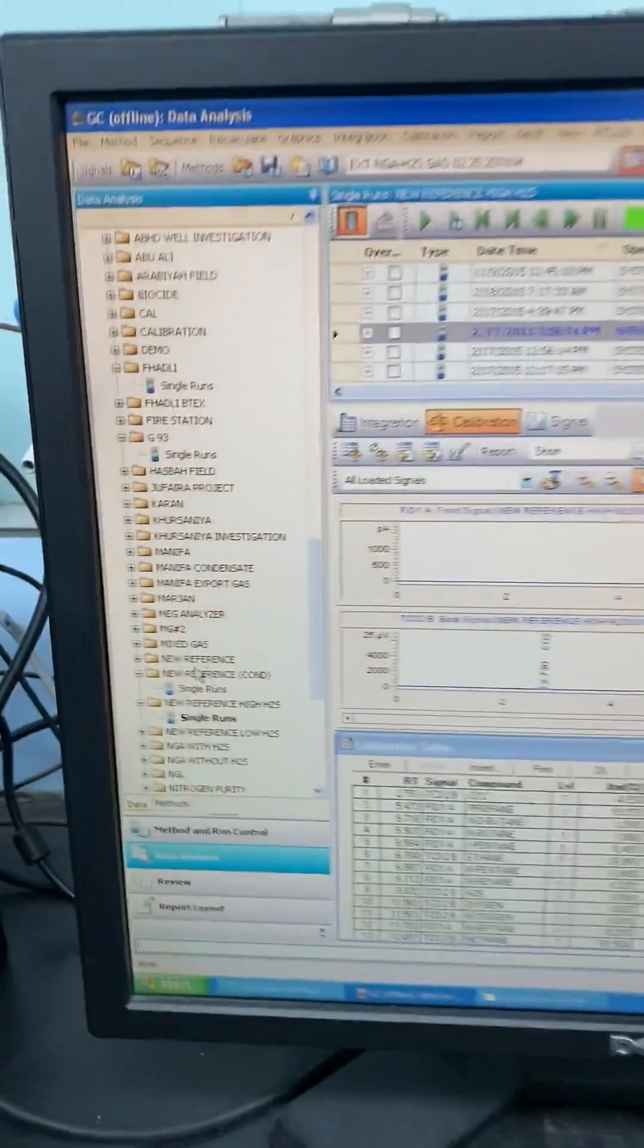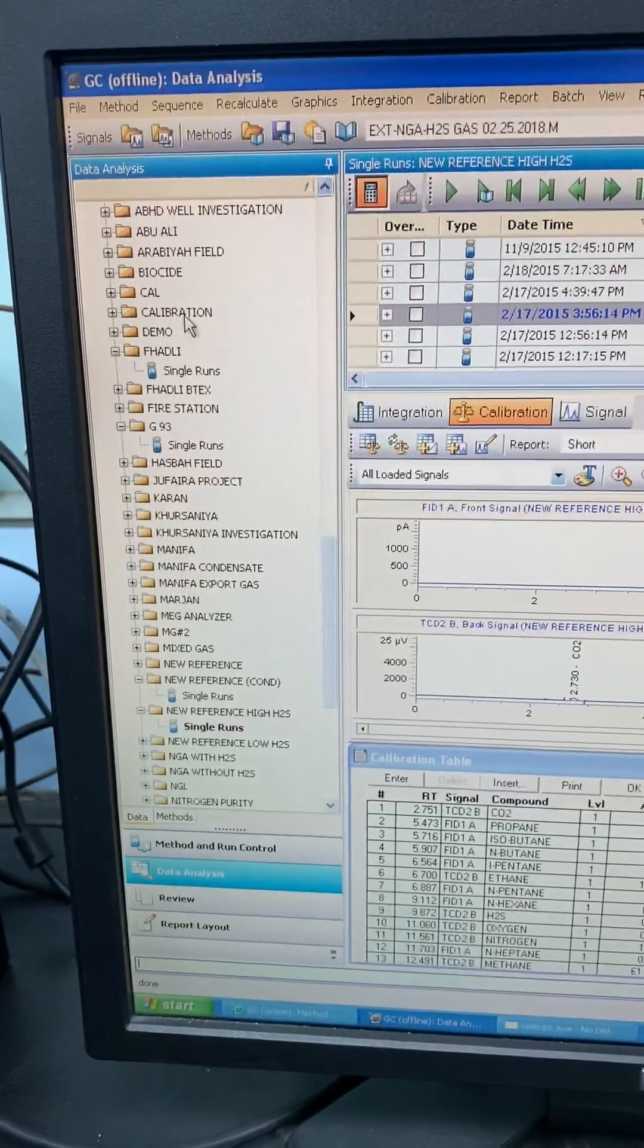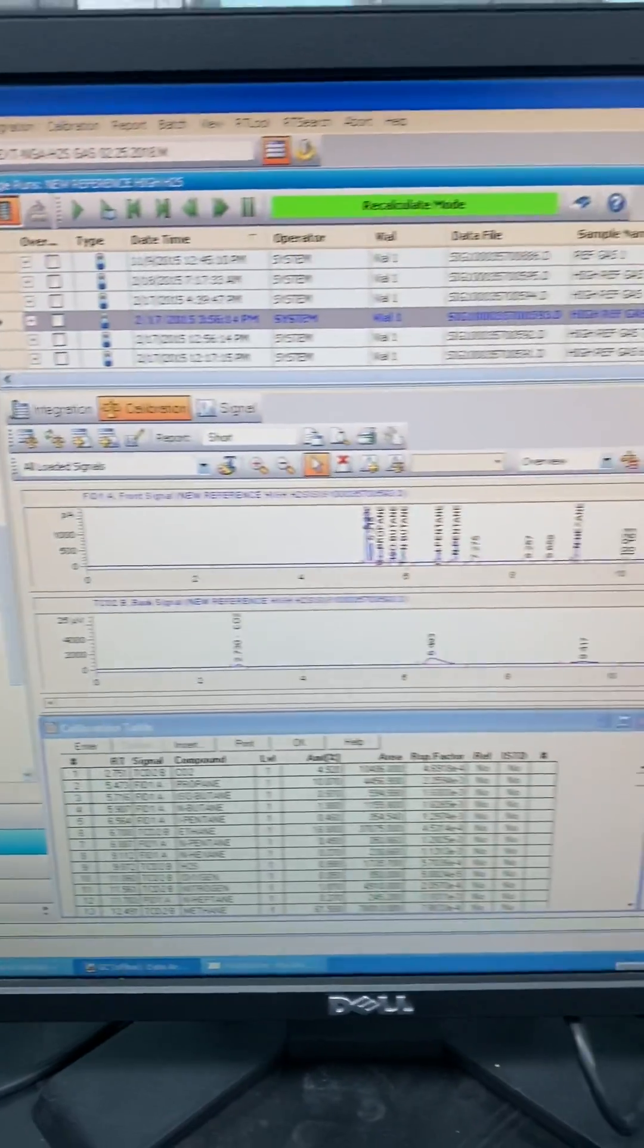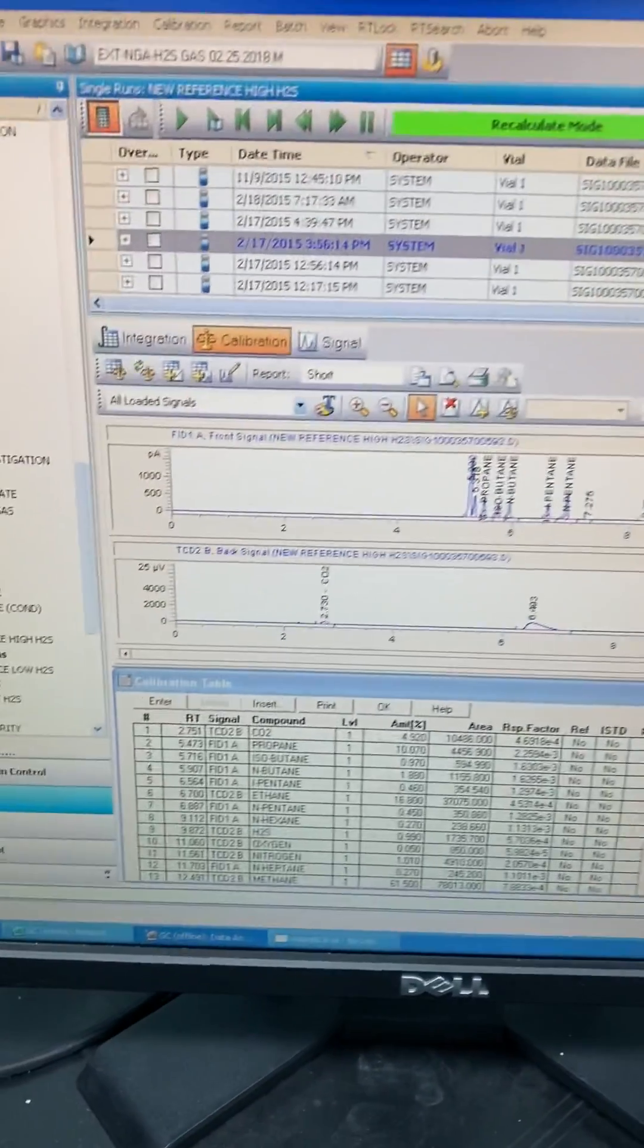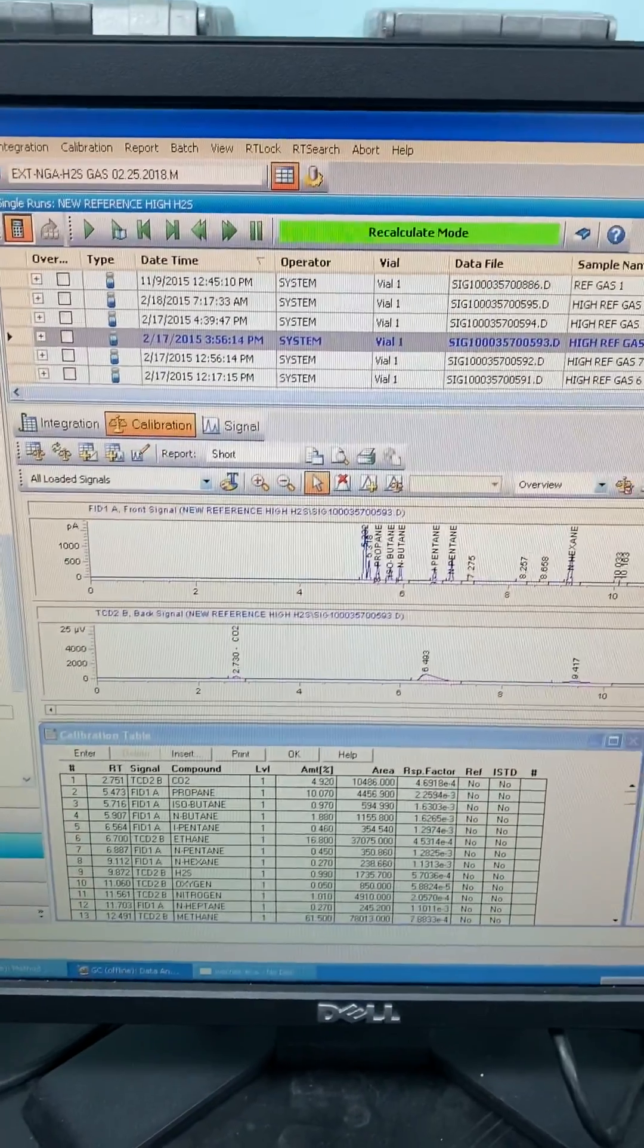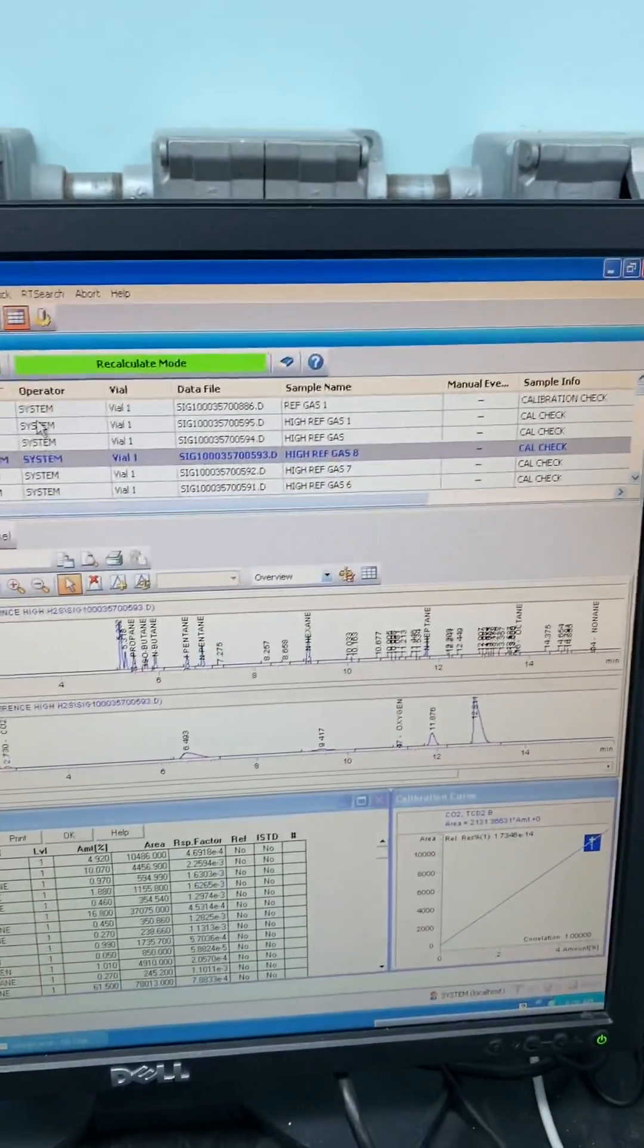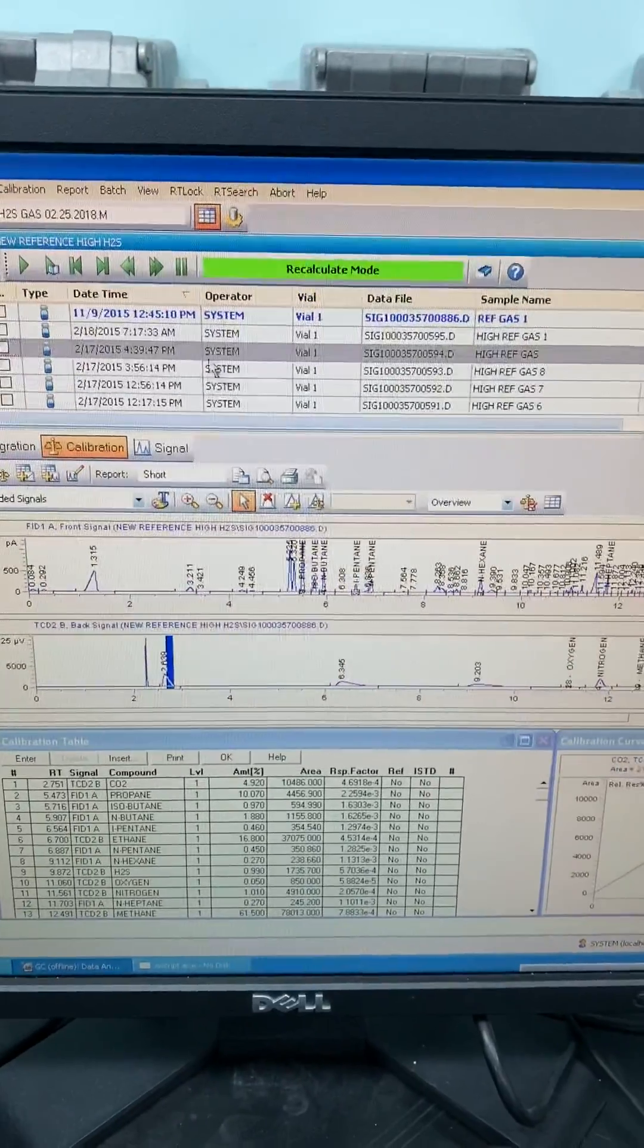Based on the folder you already saved your run or the sample, you will see all your analysis. Like here, for the reference gas, just double click, and you will see all the chromatograms already here.